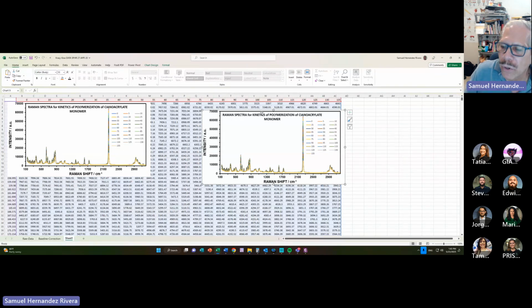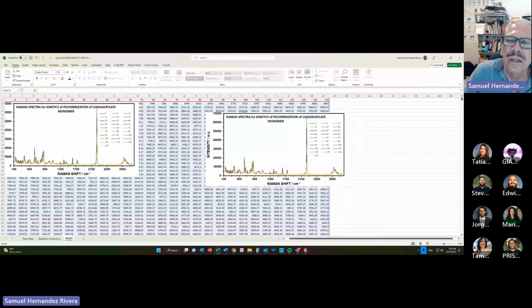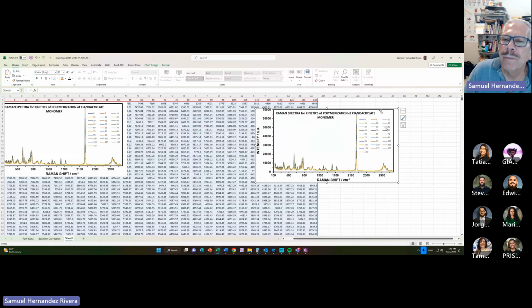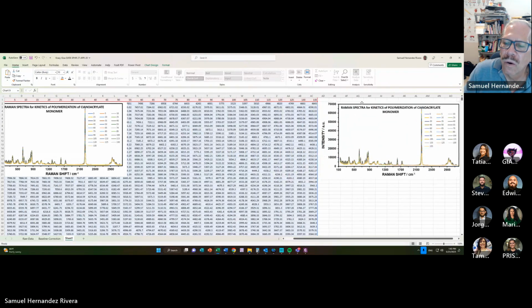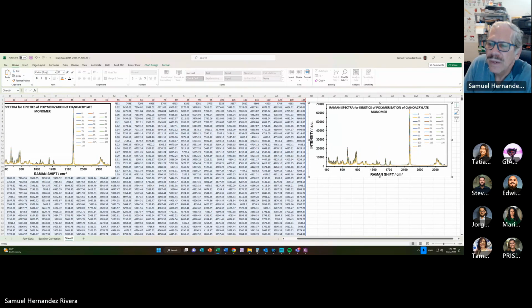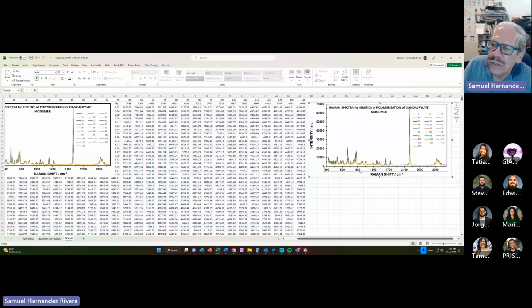Okay, let me now work on the copy of the original. I'm gonna take it all the way to the right. I want to do magic with it. All the way to the right. Okay. Now, to zoom in an area, I go and hit the left click on the x-axis and immediately after the right click.